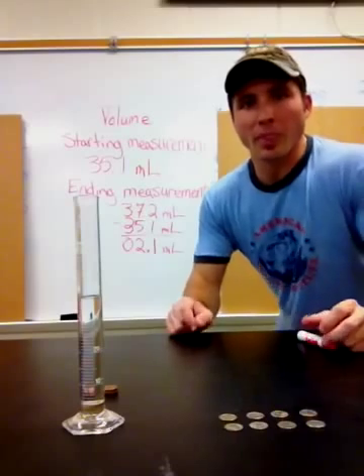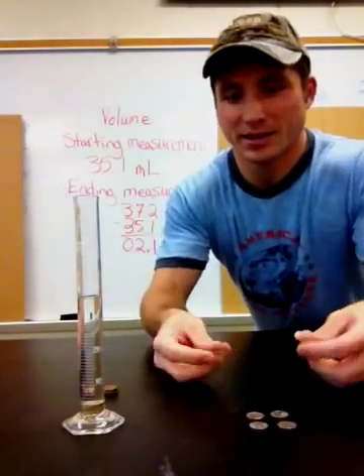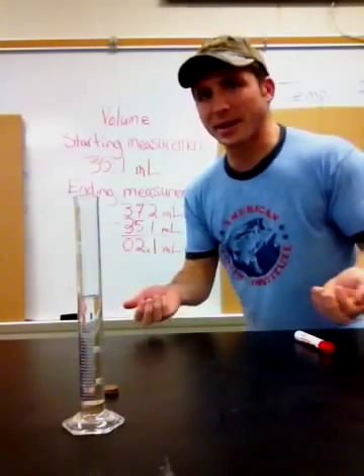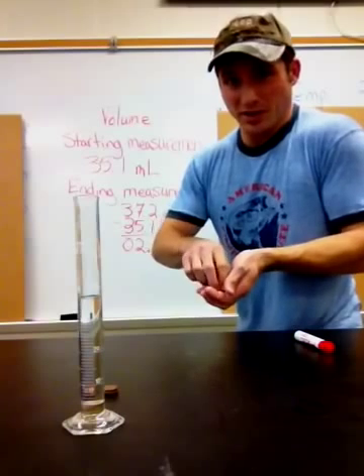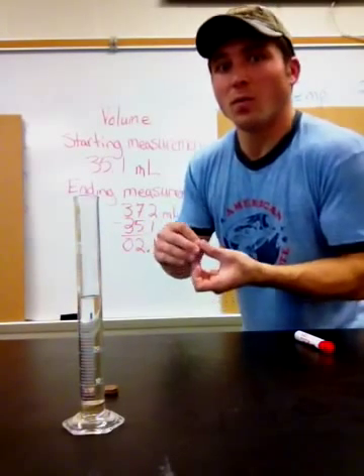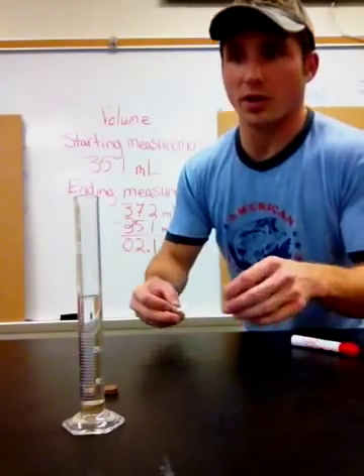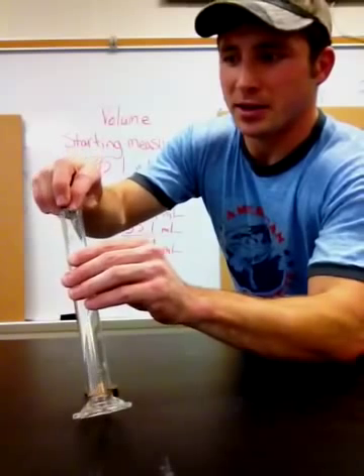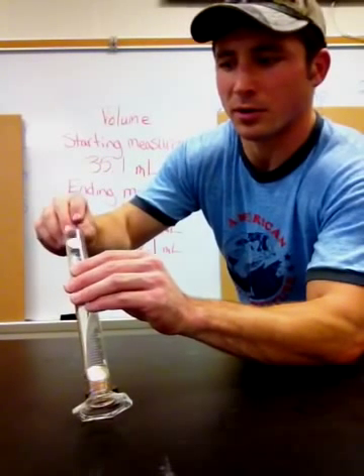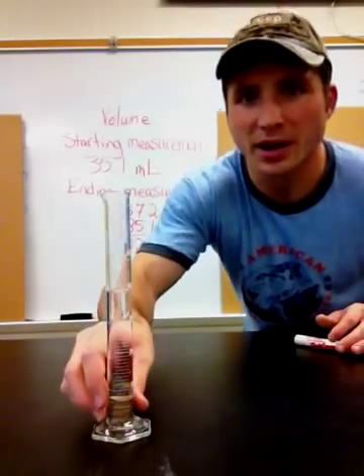Now I'm going to try to double it, so let's put eight more dimes in. If my first read was very accurate, the second one should be about the same — I should end up 4.2 milliliters higher than what I started with. Okay, adding the next eight dimes, trying not to spill any water.